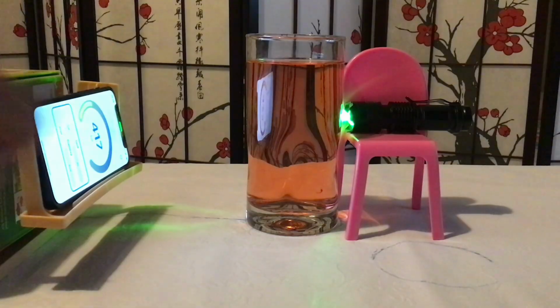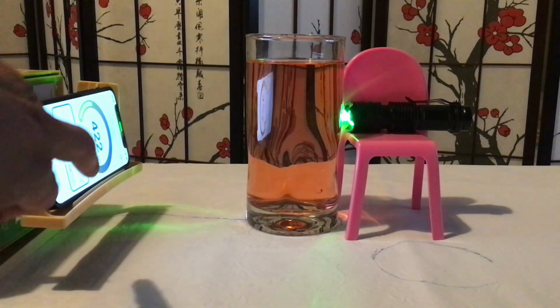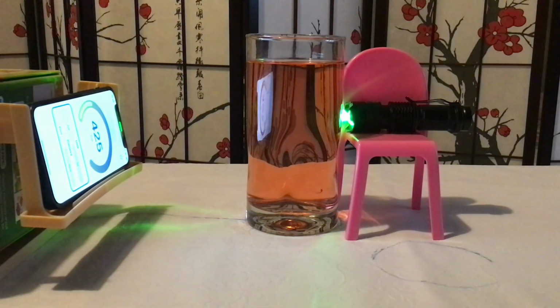Here the red color solution absorbs most of the green light and transmits only a small portion, about 425 lux, as measured by light meter. This shows that we can identify substance in a solution by passing specific wavelength of light through them.